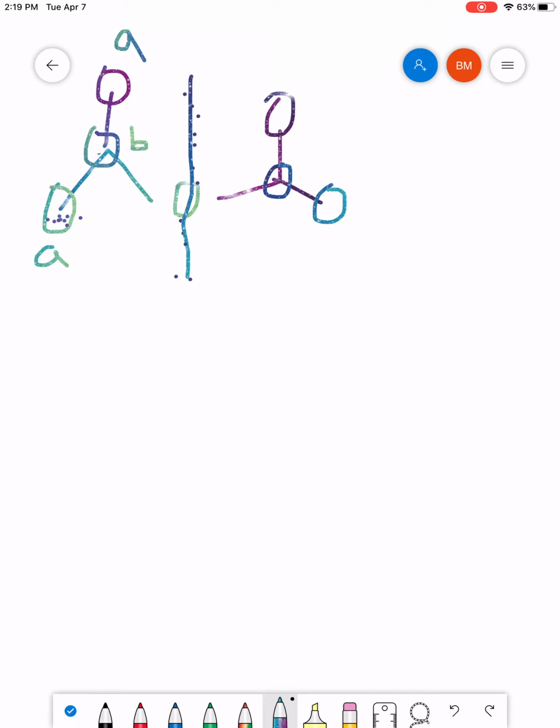Over on the right side, again, you can see that the H's of these methyl groups really aren't any different from each other or from the methyl groups on the other side. So these also would go into group A. And the one in the middle here is exactly the way the one in group B would appear on the other side, right? So we can see a case here where symmetry, even though you have several individual groups of hydrogens, really reduces the number of signals that you see because you have a lot of equivalency. So this one would give you 2 signals.